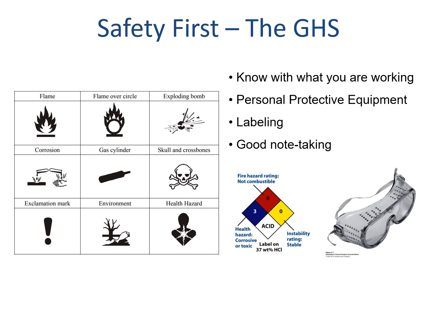In the second row, we have the corrosion indicator, which is a picture of a substance dissolving the table or a person. These are often strong acids or bases, which we will use in lab.